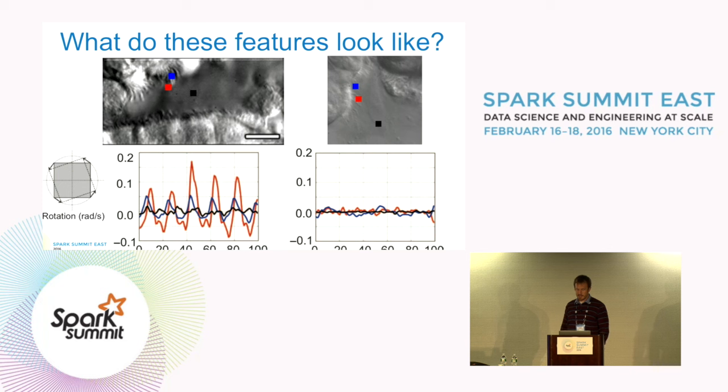And we can plot, say, rotation in radians per second computed at each of these pixels at each frame. And there is quite a stark difference between the two, especially as you move along the cilia towards the tips. That's the red line, highly periodic. So we see a very nice temporal pattern with quite a degree of rotation, which makes sense. Healthy motion, the cilia is going to bend significantly. There's a lot of rotation happening. I didn't show deformation, but it follows the same qualitative properties.